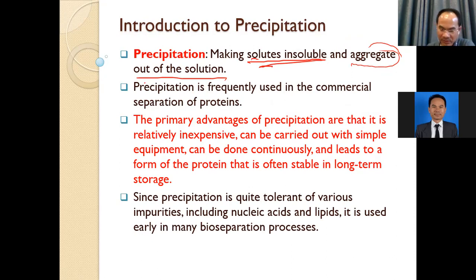And also we can use precipitation of protein. For example, if the solution includes only two components, water and protein, you can use precipitation to purify protein.